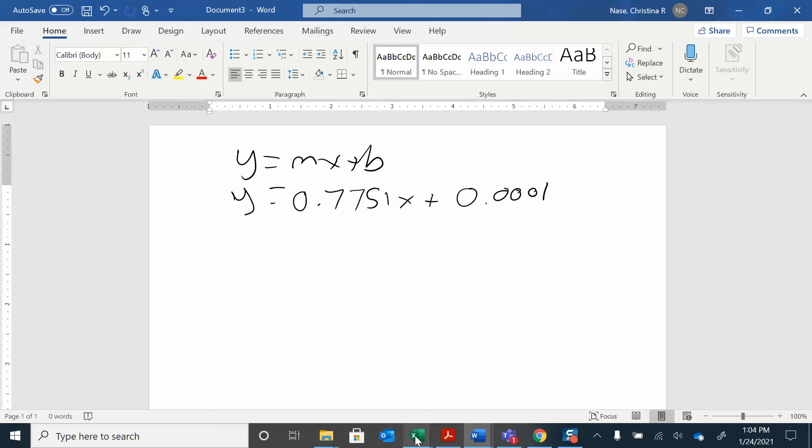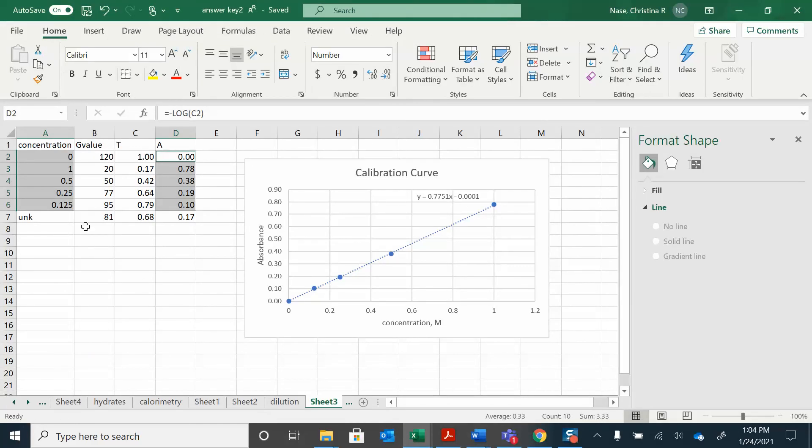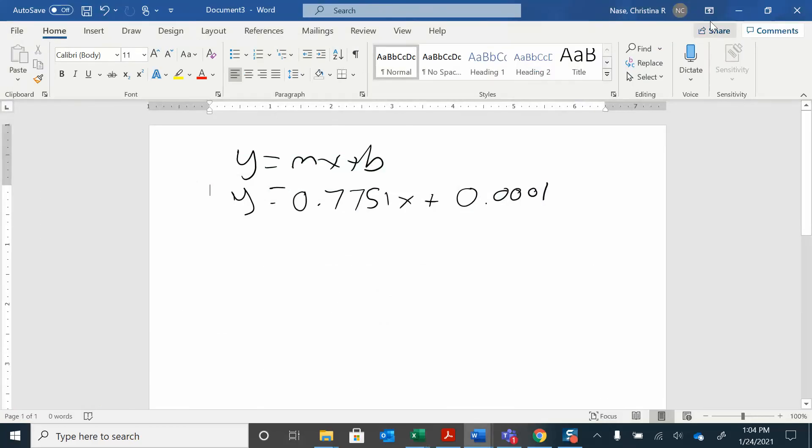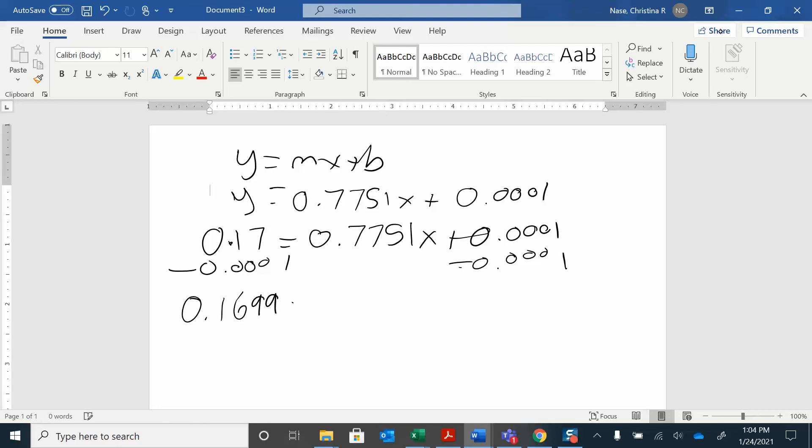So for my unknown, I got an absorbance of 0.17. So that's my absorbance. Absorbance of 0.17, which is my y-axis. And I'm looking for the concentration. So I've got 0.7751x plus 0.0001. I'm trying to solve for x. So I'm going to subtract both sides there. Subtract essentially 0. And then just divide by 0.7751.